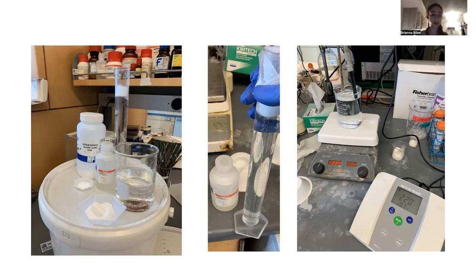So I hope this helps, and I will post a link to that recipe, and there are other recipes out there. Find what works for you. And hopefully you're doing this because you wanted to look for multiple things and not because you put the wrong antibody on. That's not what happened to me this time, but it has happened to me before.